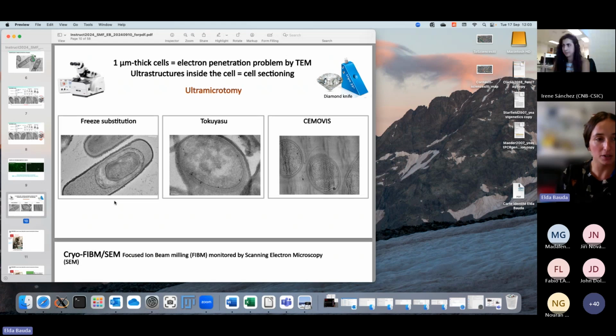Concerning segmentation, yes, I've sometimes done manual segmentation when the neural networks, for instance, were not able to segment properly. But for the ribosomes, when I have a lot of the thing I want to segment in the tomogram, I used EMAN2. EMAN2 has neural networks integrated, and it's really powerful to segment your tomograms. You just have to train. For instance, you select 10 ribosomes and you draw inside the ribosomes where your ribosome is, and then the neural network will be trained on that and is able after that to get all the ribosomes in all the tomograms that were acquired with the same parameters. So my two tools are IMOD for manual segmentation and EMAN2 for automated segmentation.